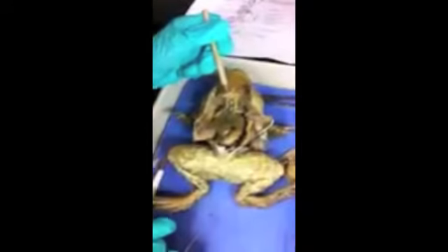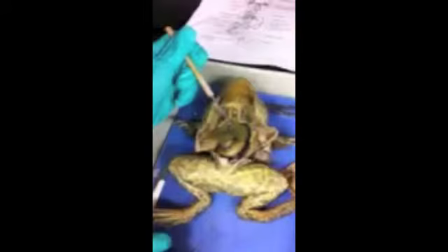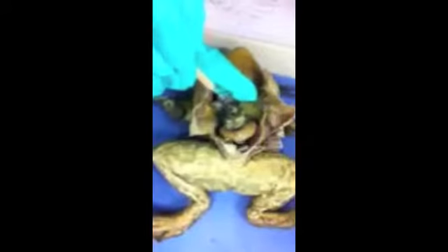And up here is the liver, which has 3 lobes. The liver is lateral to the esophagus and leads to the gallbladder, which is right here, this little sac right there. It actually has liquid inside of it.